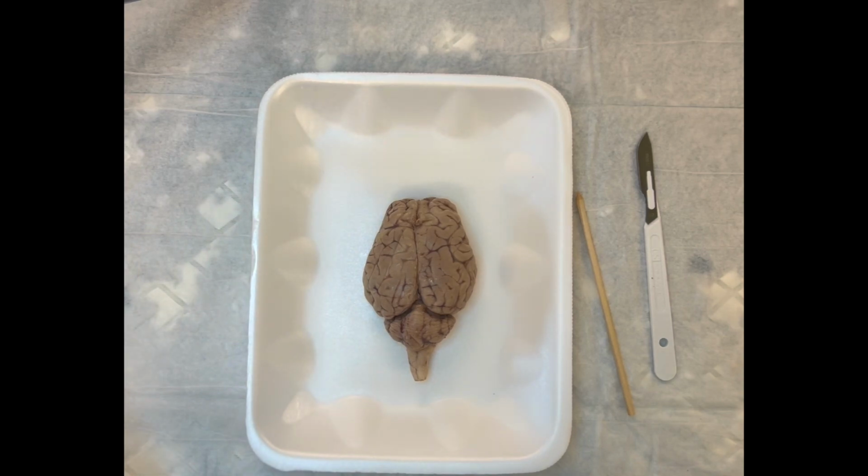So right under the lab folder, you will see a nervous tissue and brain lab document, and there's some great visuals there for you. I'd recommend having those out as well. You're going to be going back and forth quite a lot. You may feel like you have to take a glove off so you can flip a page. You do whatever you got to do. Make the most out of this dissection.